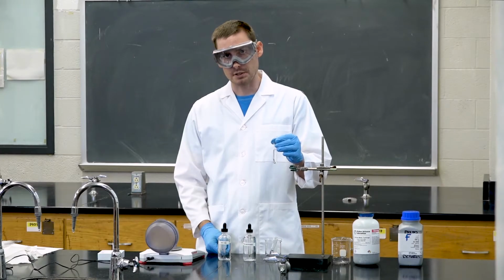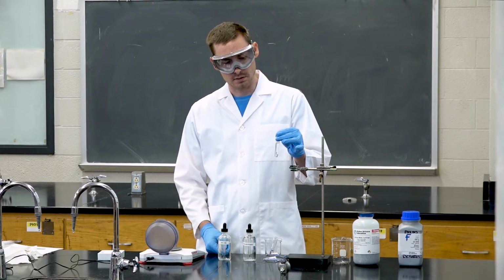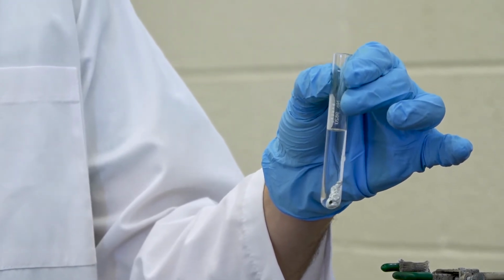So unlike the hydrogen chloride or the hydrochloric acid reaction, zinc is very stable in water, as you can see. So you can leave this for a little while and observe the reaction to see if any hydrogen is produced, but most likely none will be.